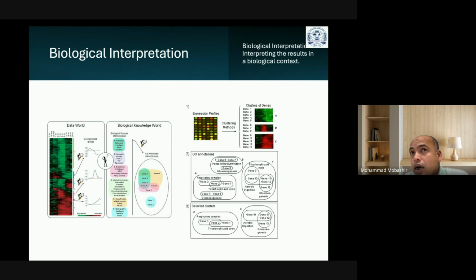If you are downloading publicly available data sets, then for almost all the microarray data analysis, there is inbuilt software which automatically analyzes for different groups, and the groups you can assign, and they will generate the differentially expressed genes with fold changes and p-values.